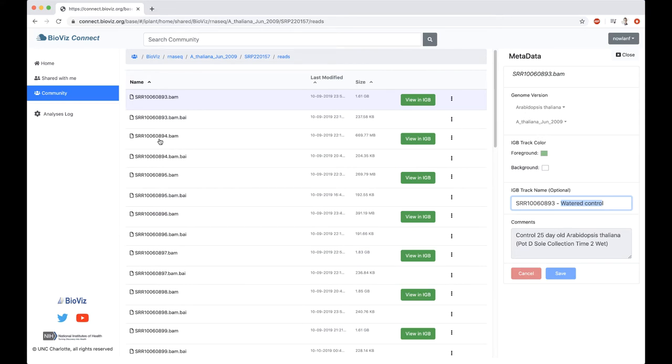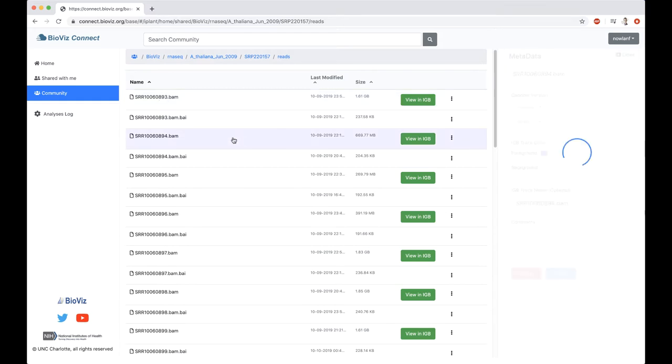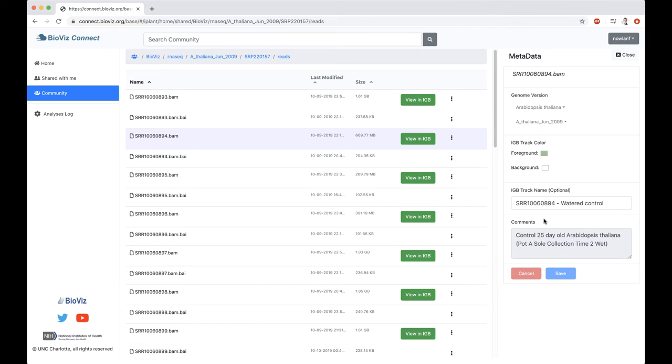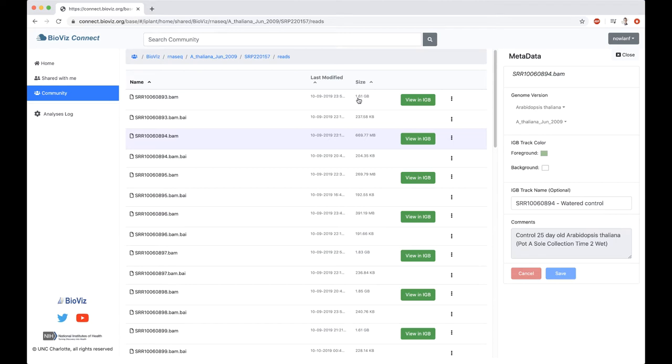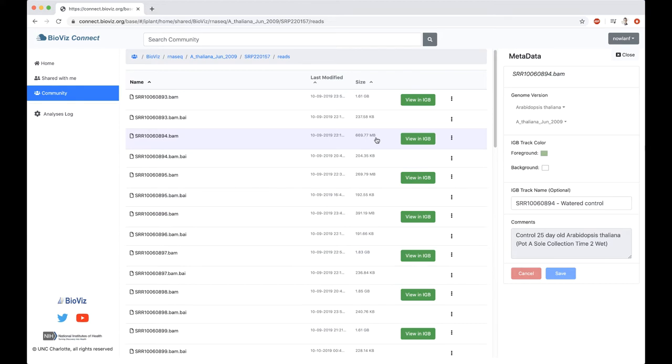Now, the file that we're interested in is this 894. I know that 893 and 894, these are both control samples. Both of these samples were sequenced on Illumina platform, should have been to the same depth. I've noticed that in my size column here, my 893 sample is only 1.61 gigs, but my 894 sample, which should be about the same size, is only 669 megabytes. Something weird is going on here, and I want to take a look and figure out what is going on.